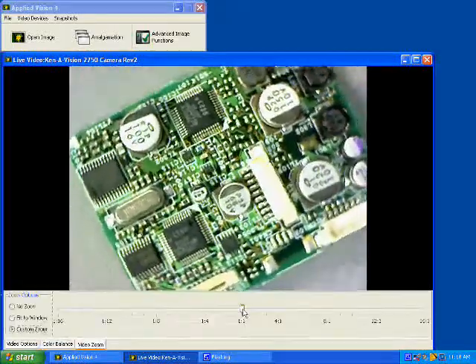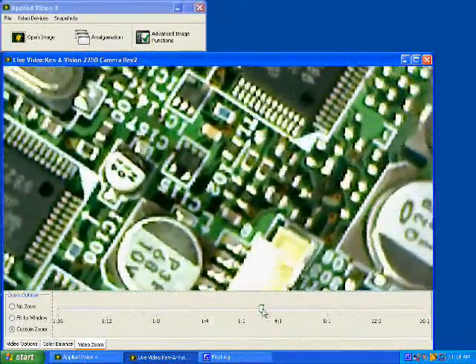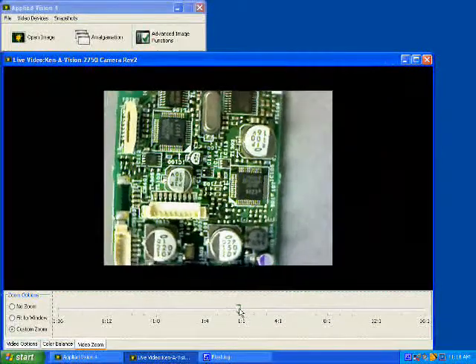Video Zoom is a new feature that enables digital zooming on a live video signal.